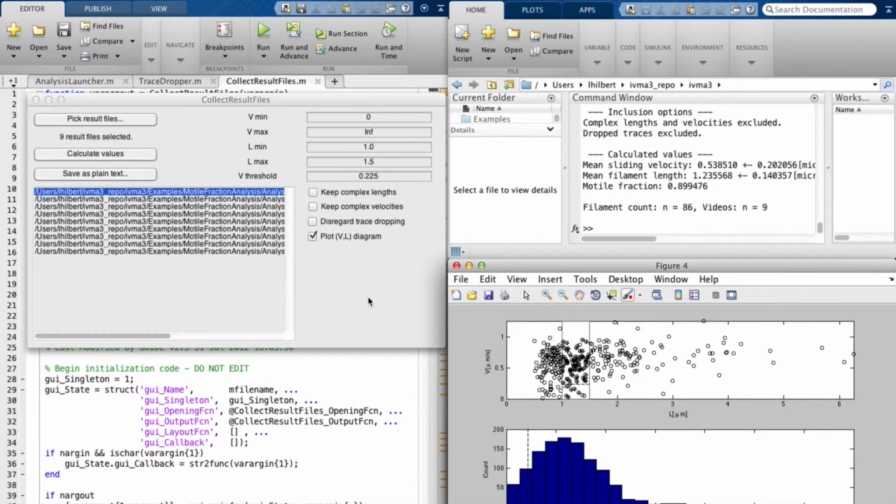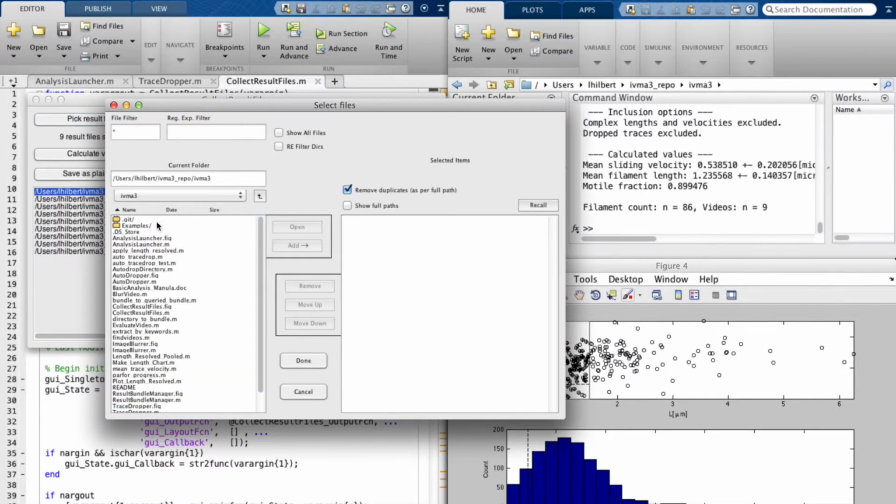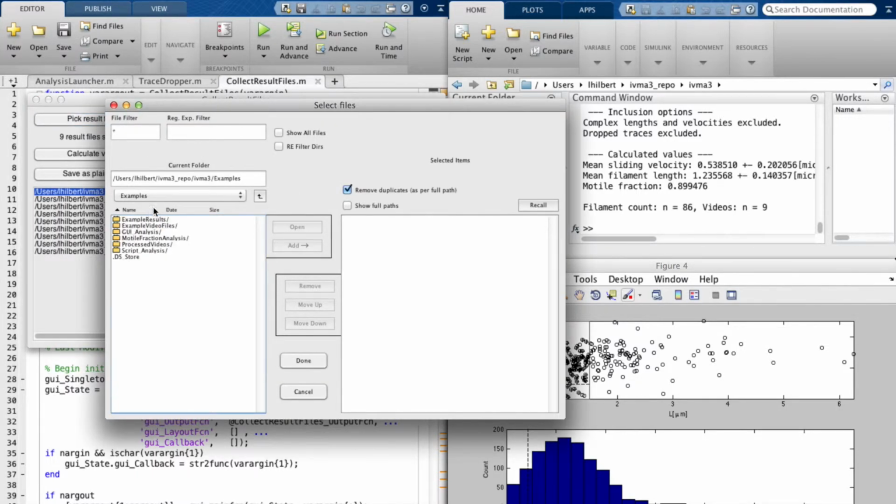Okay, so now we have this range here where we determine the motile fraction, and I think we're pretty well set up to start analyzing the slides separately, which is basically what we're going to do now, keeping these parameters the same across all of the slides, so those have to be consistent.